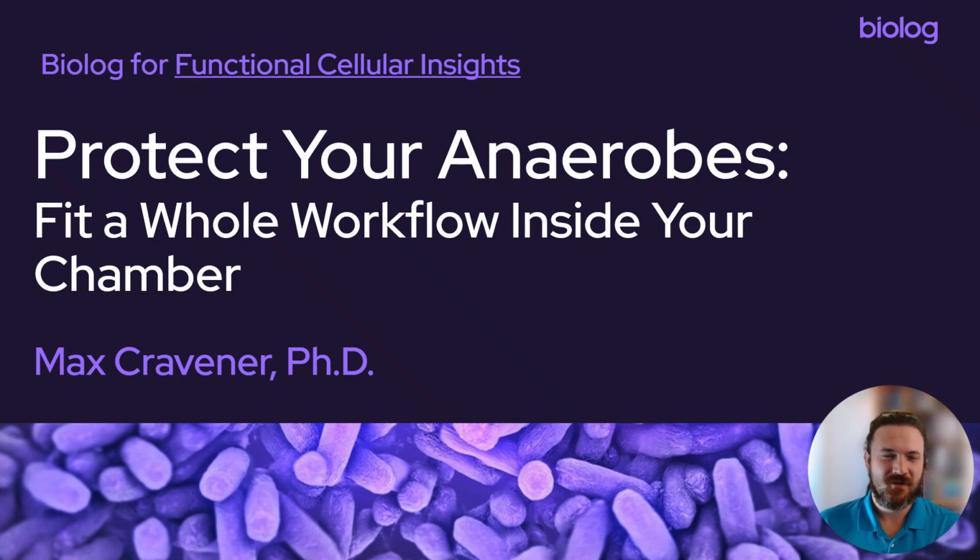Thank you, Misha. As she said, my name is Max Cravener, and I'm the product manager for instruments and software here at Biolog. And today I would like to talk to you about how you can protect your anaerobes by bringing your entire workflow into an anaerobic chamber.